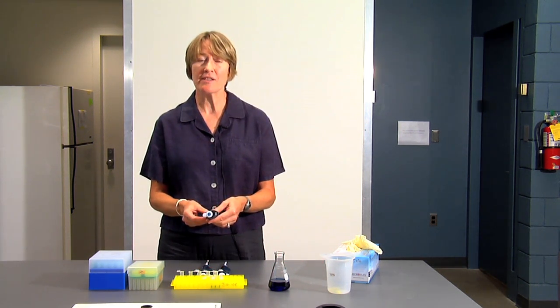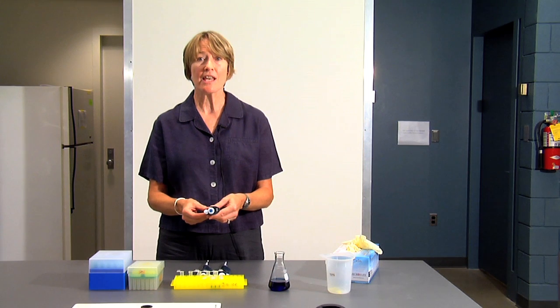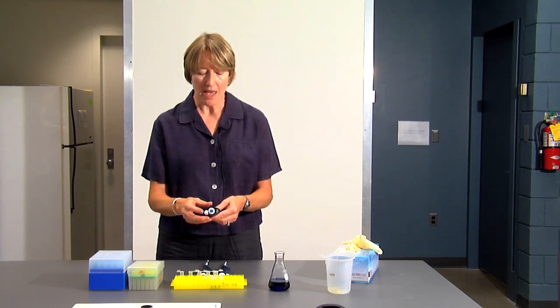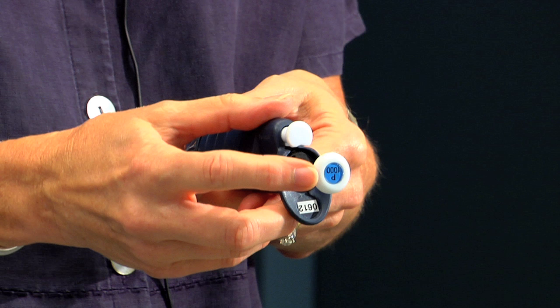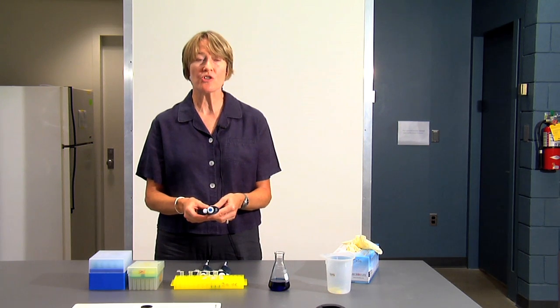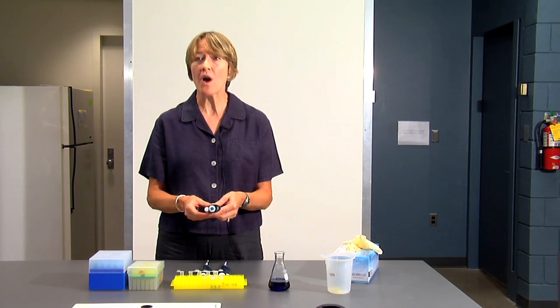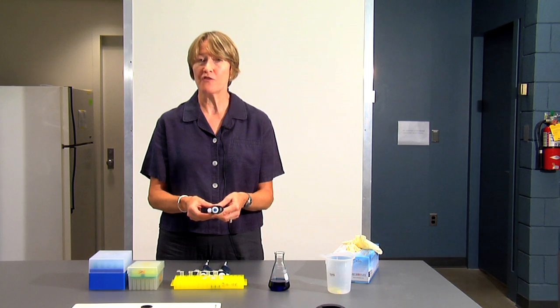The last size micropipette that we'll be using is the P1000. Notice that that says P1000 on the plunger, and it measures 200 to 1000 microliters of fluid accurately.